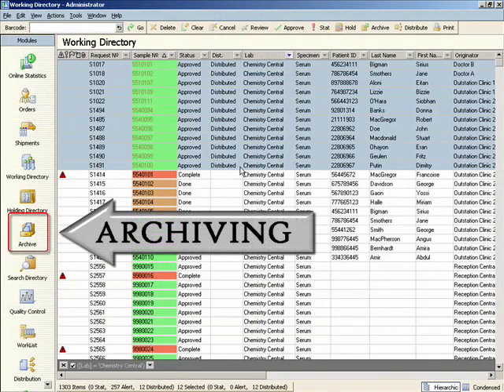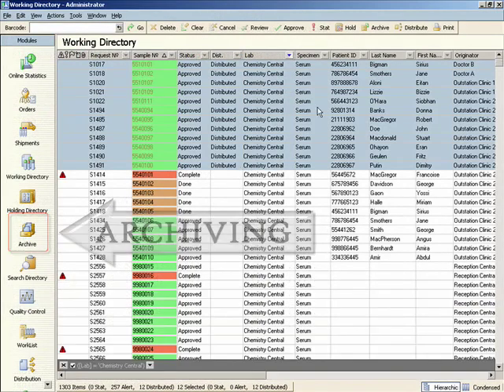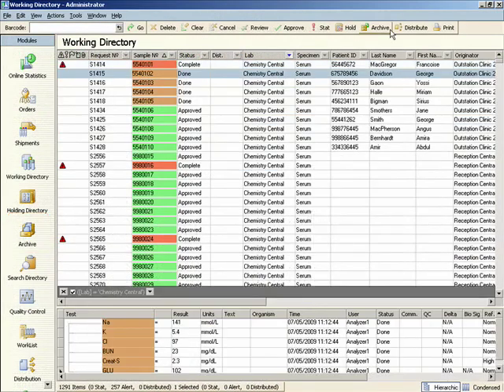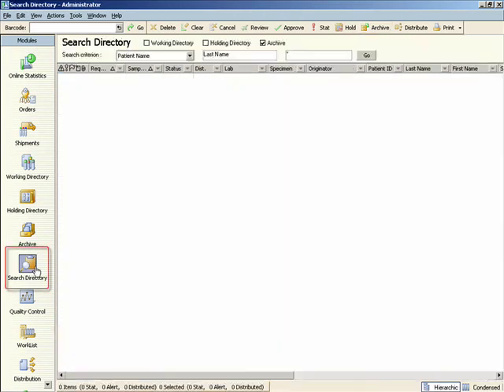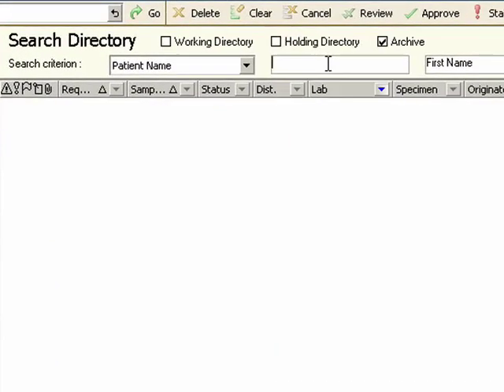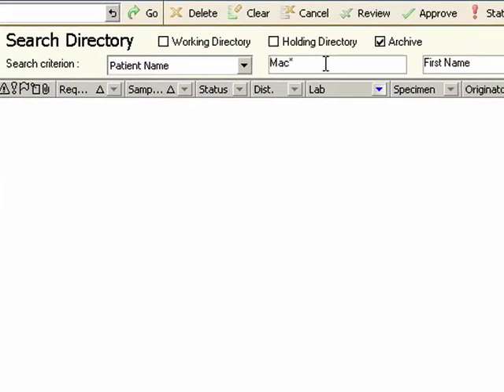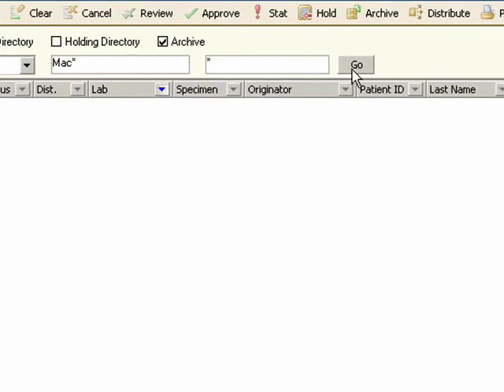Archiving is carried out automatically or manually, as configured. Filters allow the archive contents to be displayed to meet any search criteria.